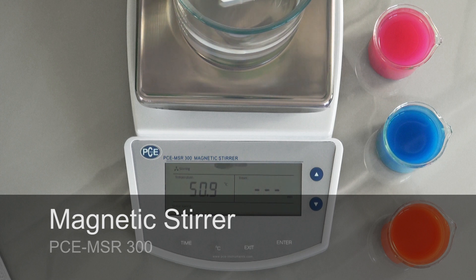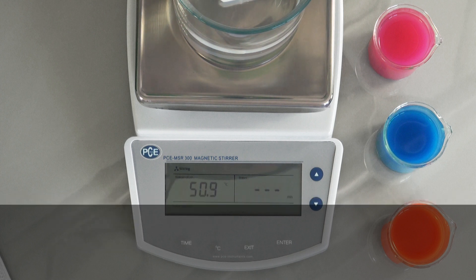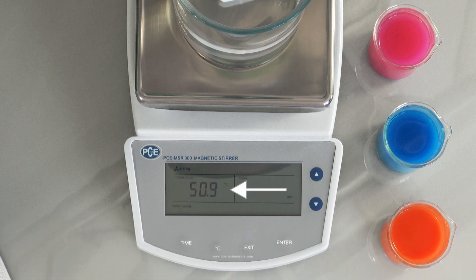In the display you can see the actual measured temperature of the temperature sensor. The stirring speed can be set in 35 steps up to 1250 revolutions per minute. For this you must press the arrow keys on the right-hand side.